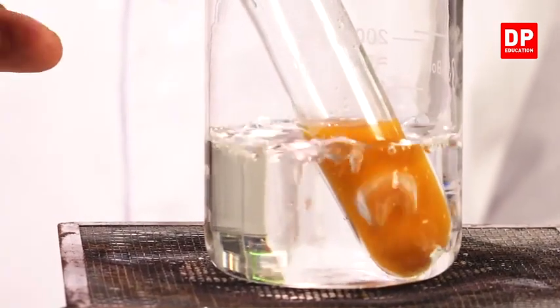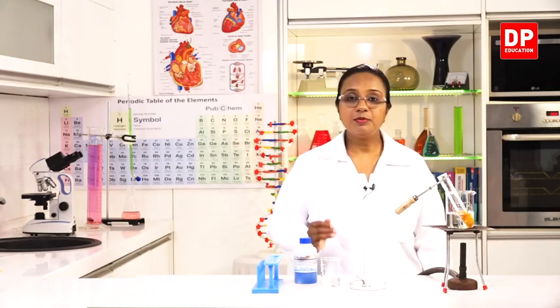So students, you have observed the color change clearly. The blue color of the copper sulfate became green, then it became yellow green, finally it became a brick red color precipitate. So this color change confirms the presence of glucose in food samples.